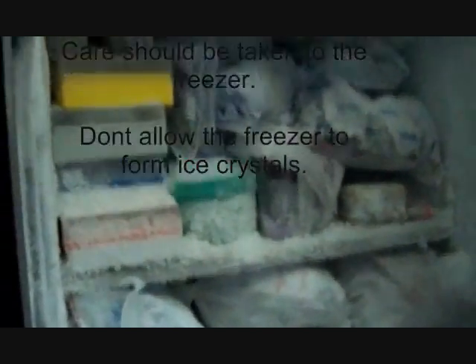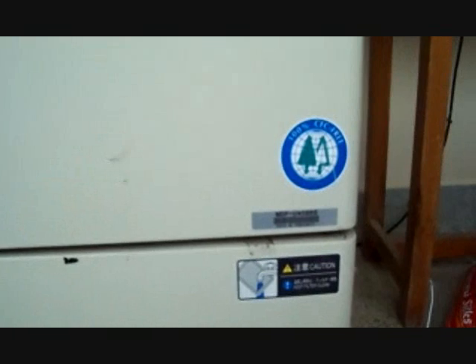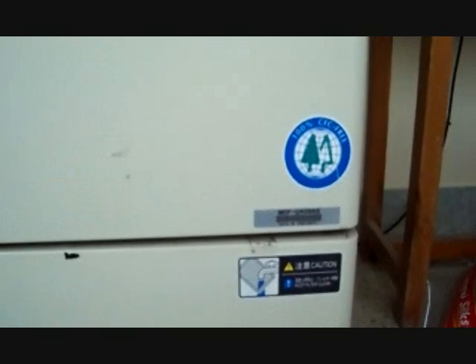Care should be taken with the freezer. Don't allow the freezer to form ice crystals. This 100% CFC-free refrigeration system ensures stable temperature, long-term reliability, and reduced energy consumption.